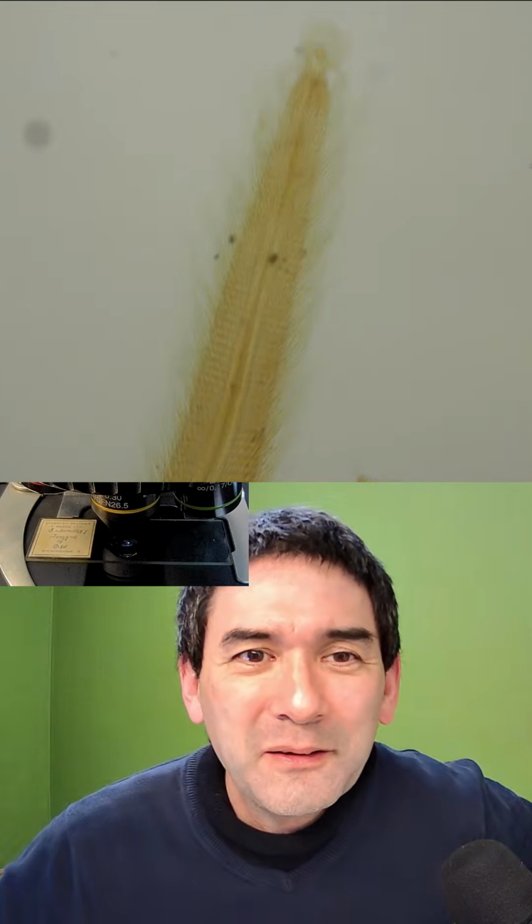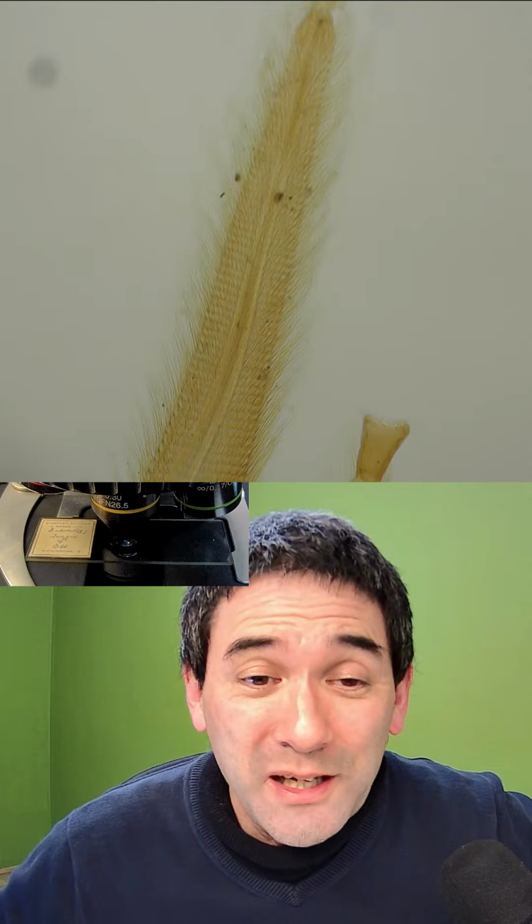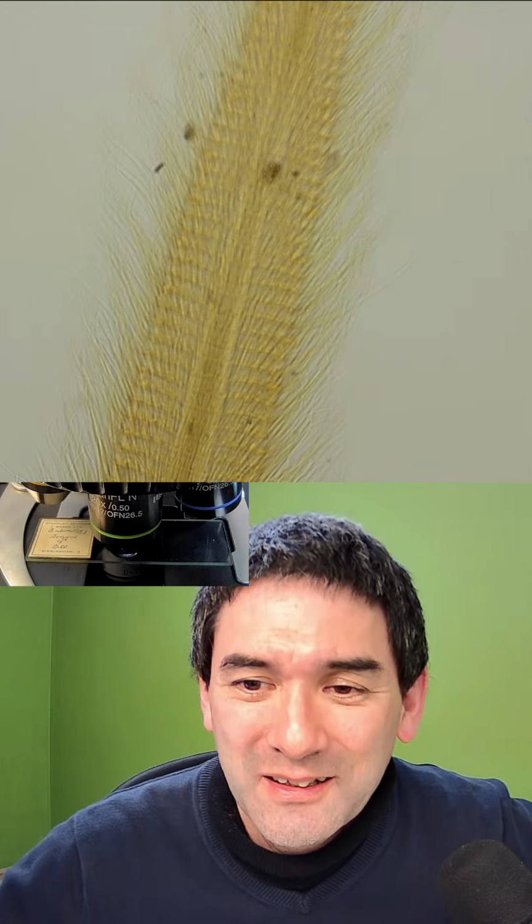So that is basically what you see over here. That's the tongue of a bee. I'm always kind of surprised, not only at the beauty of nature, but this has to be preserved somehow, right? And that it was able, with proper preservation, to survive, let's say, 100 years or longer, is quite surprising.